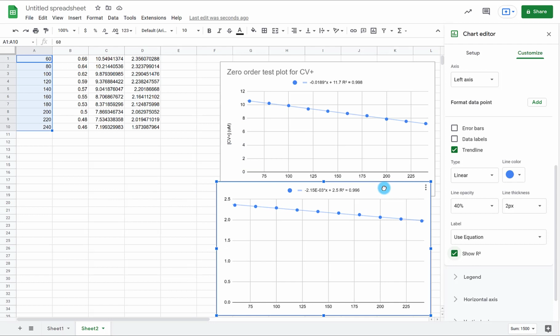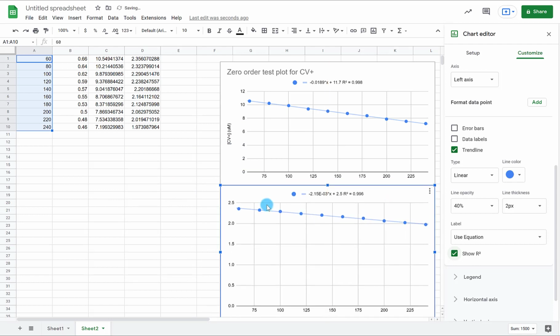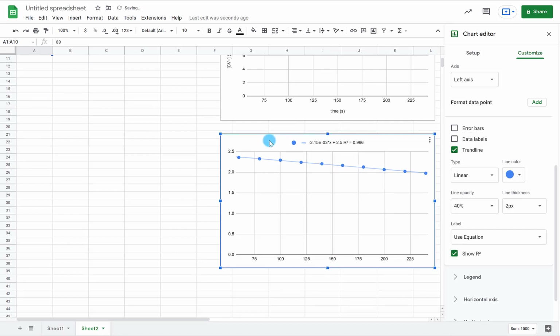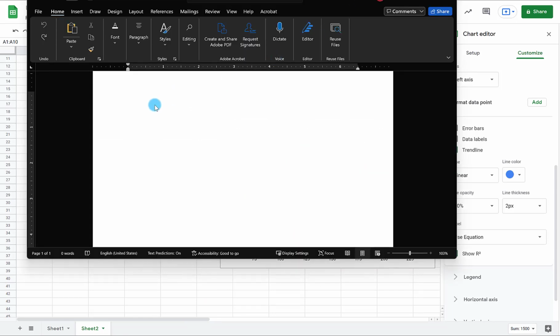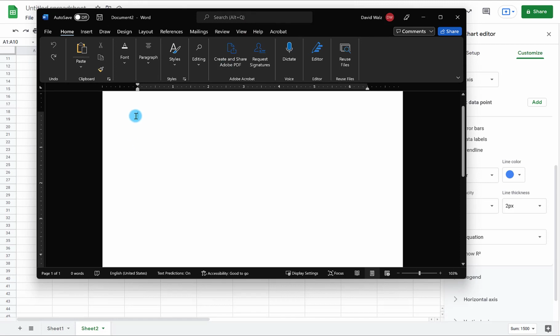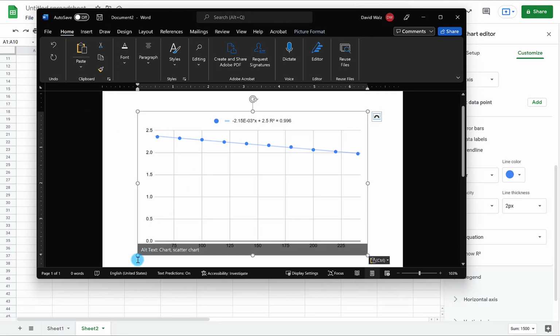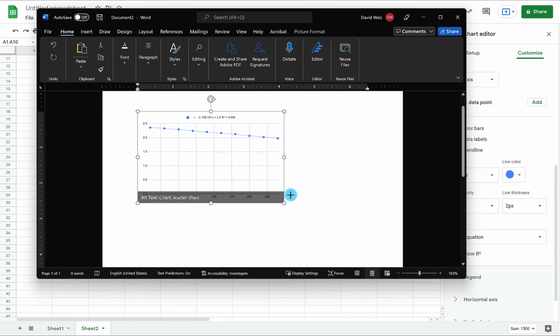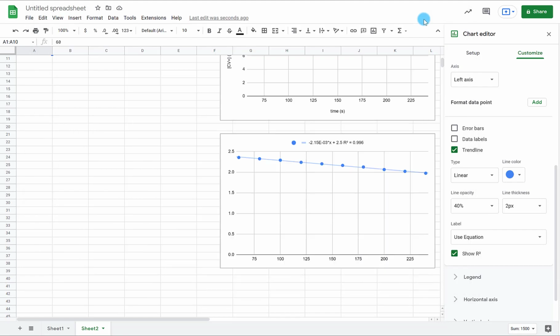So this is for us to discuss, but you need to have these graphs when you're in class. You can take one of these if you want to make them smaller. You can control copy, open up a blank Word document or a Google Doc, and then control V and paste it. Shrink it up so you can get them all on one page and print it. Obviously, you need to title these. I showed you how to title it. I'm not going to do it again.